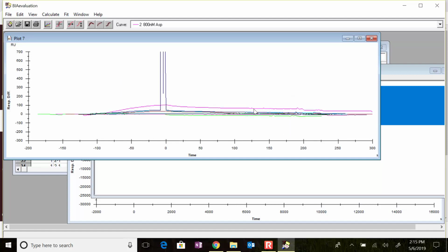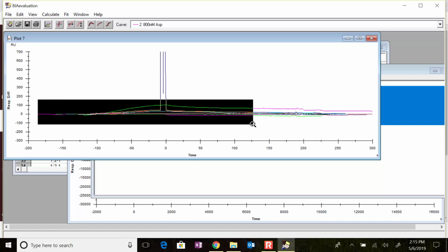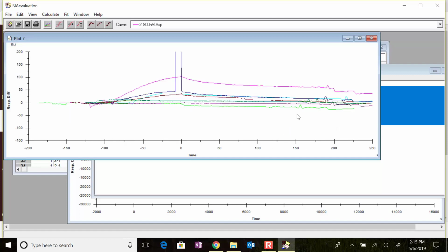Okay, and now I have to zoom in each time. That's one of the annoying things about bubbles. It's definitely looking better lined up now than it was before. I think that the blue one is definitely a lost cause. The purple one actually has a little bit of a divot in it. It's kind of weird, but it will work for the illustration's purposes. And I think it's good that I can show you what to do with non-perfect data.